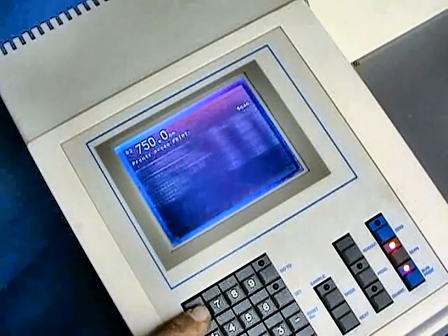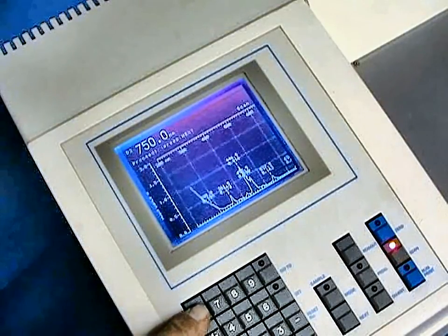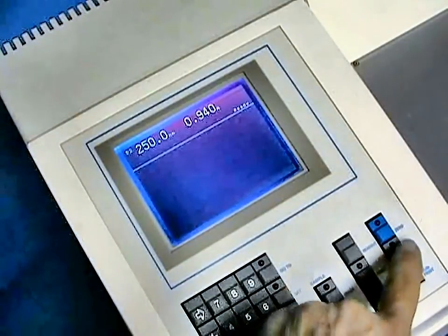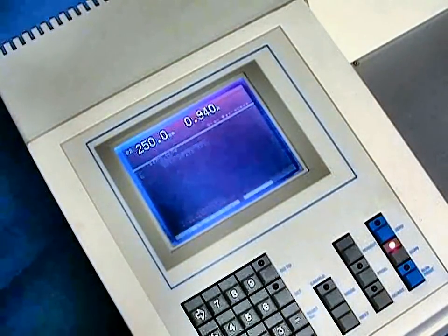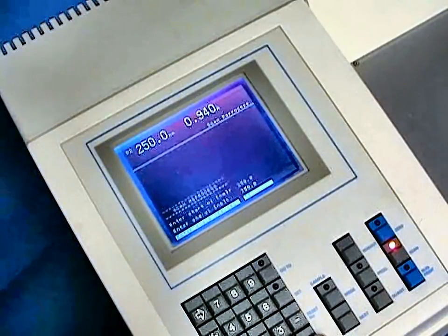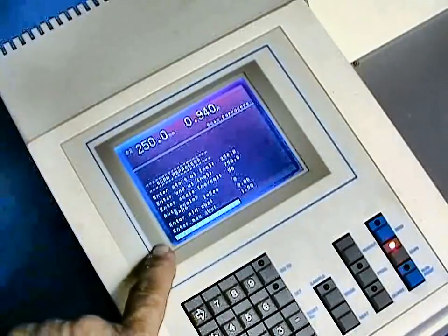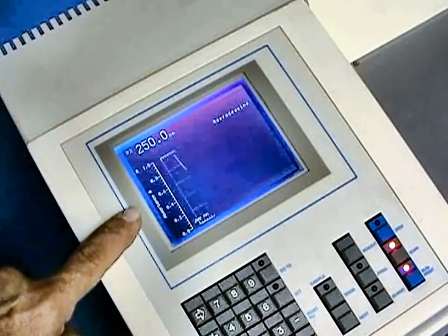Once this is done, we can go back to our spectrum using the left-right cursor arrows. We can either print this out or reprocess it to optimize the scale. We can reprocess a stored scan by selecting the proper menus from the system, either auto-scaling or defining the scale for our spectrum, and by pressing the flashing key, quickly display the new spectral information.